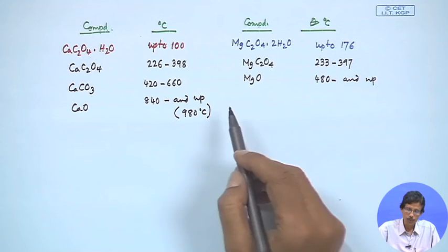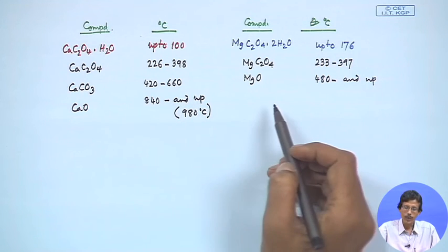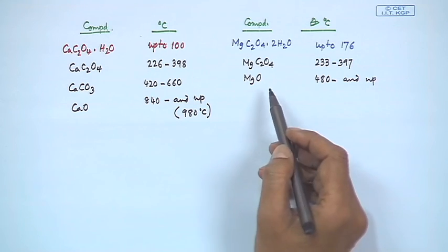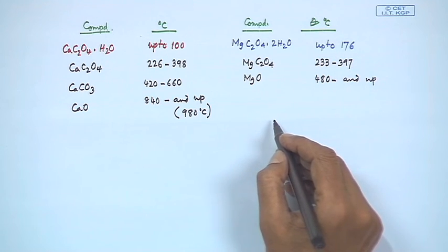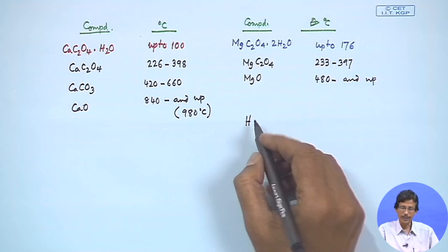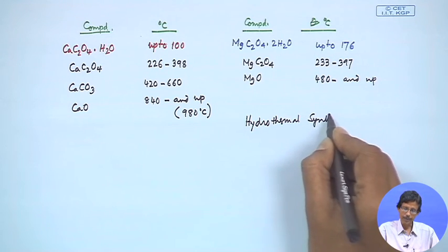If we do not have the corresponding plot as a thermogram, we should know the analysis in this way, and you see that not only is a single compound undergoing thermal degradation, but it is transforming into some useful species, which is also a very useful technique of thermal analysis. And sometimes we go for a technique where thermally we can synthesize some new compound, some catalyst, which is a useful technique that researchers are using nowadays, known as hydrothermal synthesis.